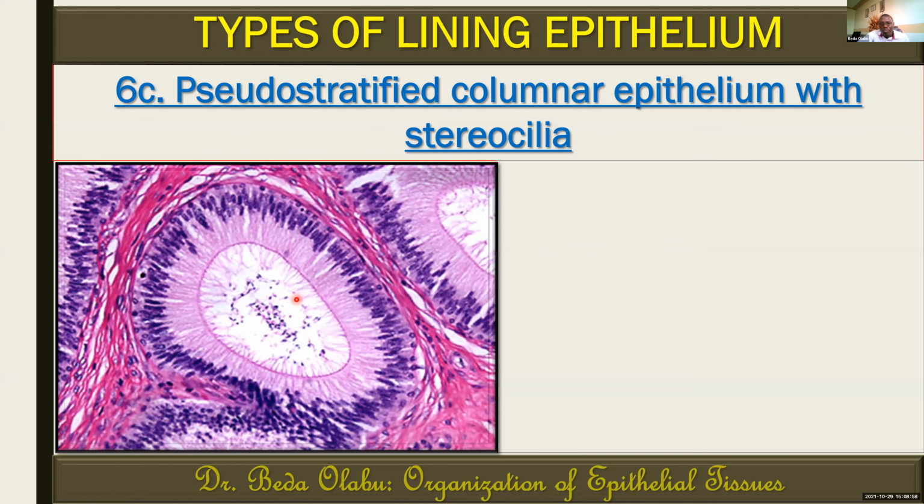How do you know this epithelium is pseudostratified and not stratified? At least the simple one we can pick directly, because we'll just see almost one nuclear zone. Then you know that the cells are of the same height and same level, because you see relatively one nuclear zone.